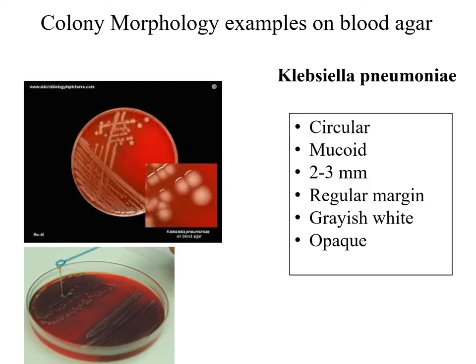Here we have Klebsiella pneumoniae. If we look at the colonies on blood agar, they are circular and mucoid — as we can see, they are sticky. They are 2 to 3 mm in diameter, have regular margins, are grayish-whitish in color, and have an opaque texture.